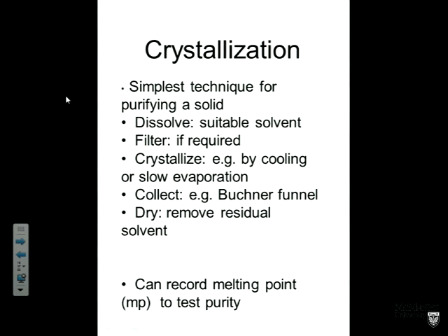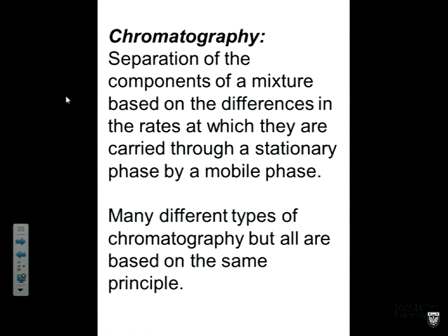So you might wonder, well, what happens if I can't find a suitable solvent? And that happens a lot with organic solids. What happens if I don't have a volatile compound? I can't distill, I can't crystallize. Oh, what am I going to do? Okay? And so the answer, of course, is to use a technique that works irrespective of whether we have a liquid or a solid, whether we have a high or a low boiling point, whether we have a crystallization solvent or not, and that technique is chromatography.